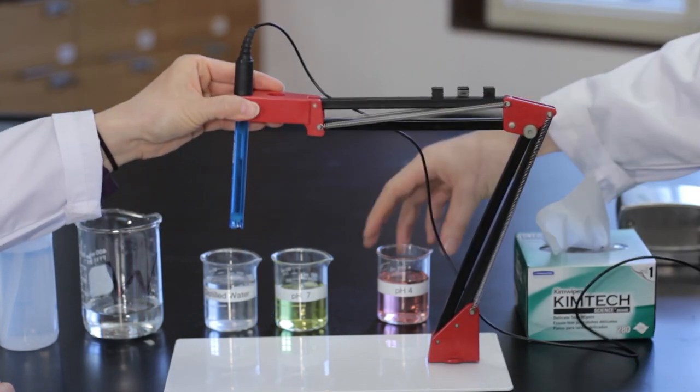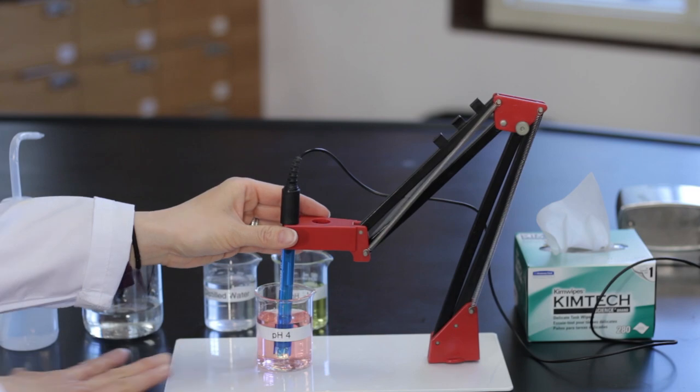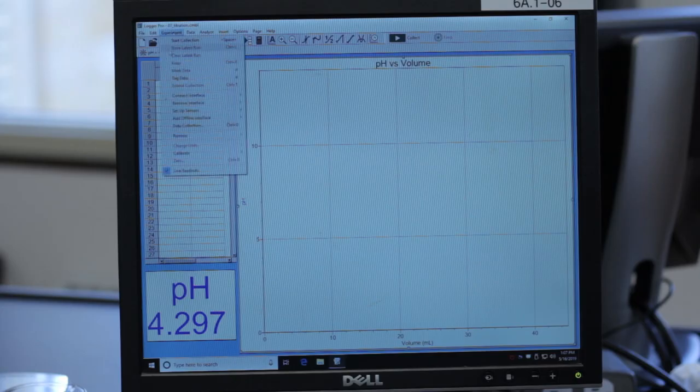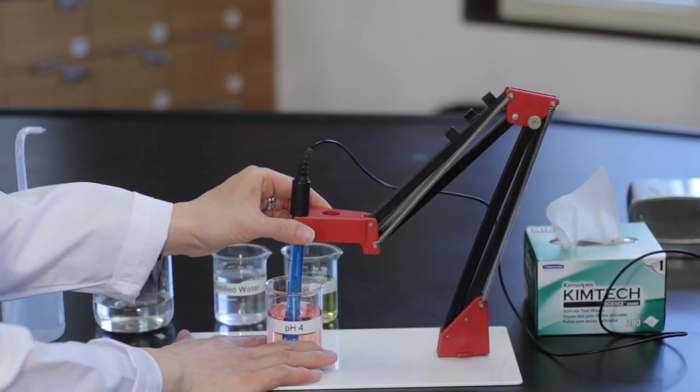Carefully insert the pH sensor into the pH 4 buffer solution, allowing about 2 centimeters clearance above the bottom of the beaker. Click on experiment, choose calibrate, then click on the LabQuest Mini 1 CH1 pH tab. Click on calibrate now. The pH value in the box is not active while calibrating the sensor. Wait for 10 seconds, then set value 1 to 4.0. Click on keep and rinse the pH sensor with distilled water.